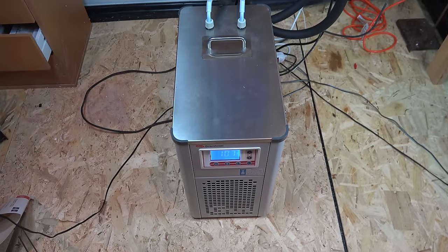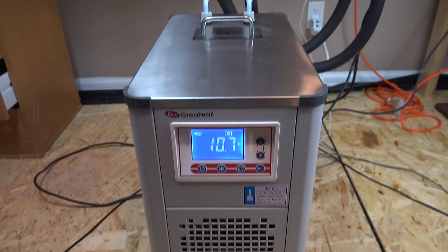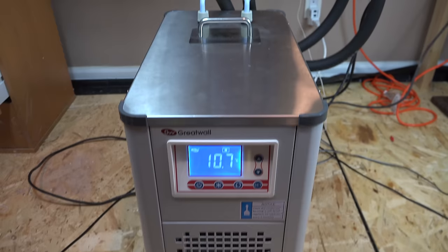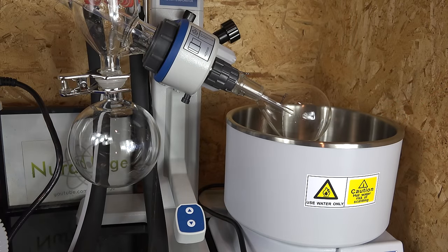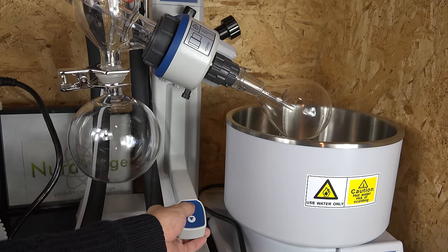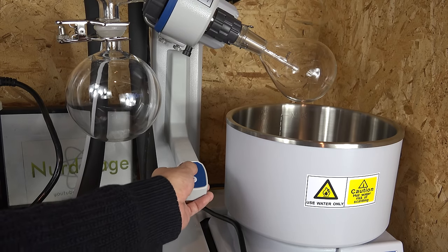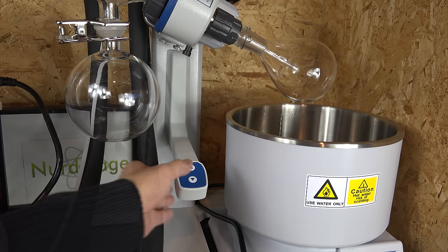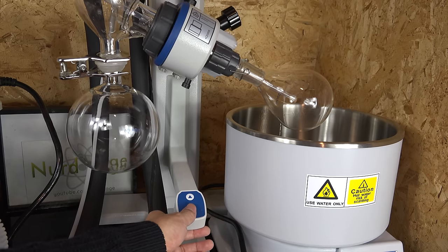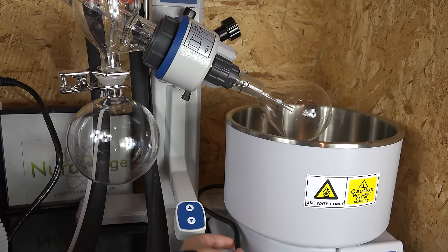That was the water chiller unit — it's optional, and if you're only dealing with high boiling solvents you can get by using the water cooler in the vacuum pump. But if you're handling low boiling solvents it's something to be considered. The rotovap here has a lift motor to raise and lower the system in and out of the heated water bath. Other rotovap systems I've seen don't have motors and instead have a hand crank or lever, and some very cheap systems don't have any lift capabilities at all and instead raise and lower the water bath itself. For many years I worked in a lab where the lift system actually broke, so we had to lift the water bath — it was not fun.